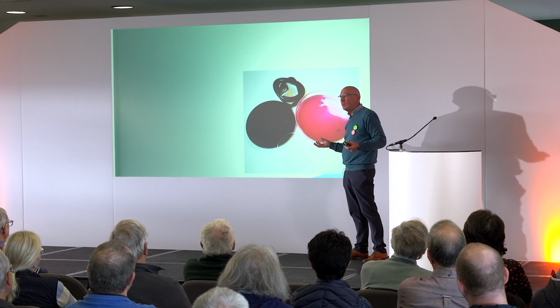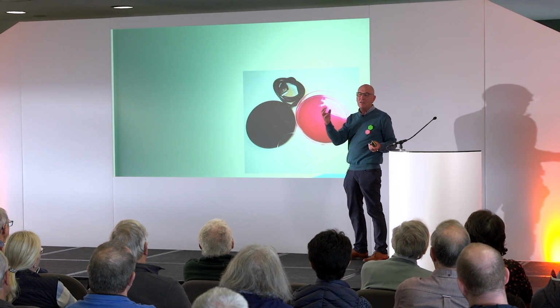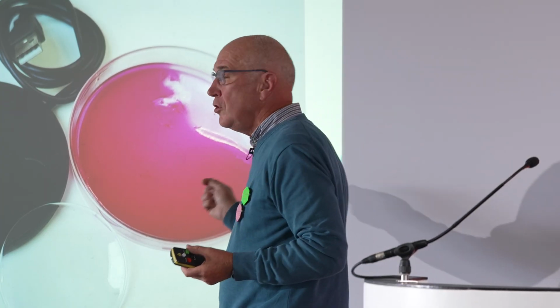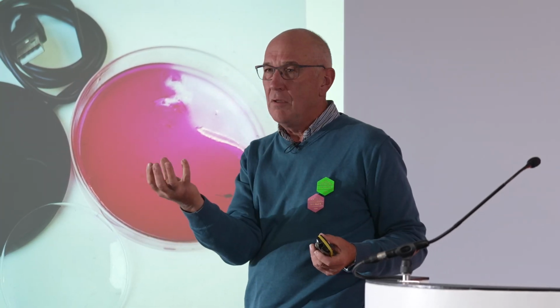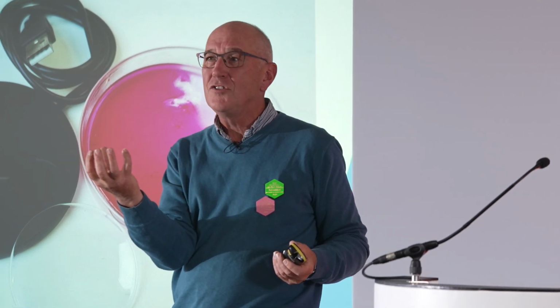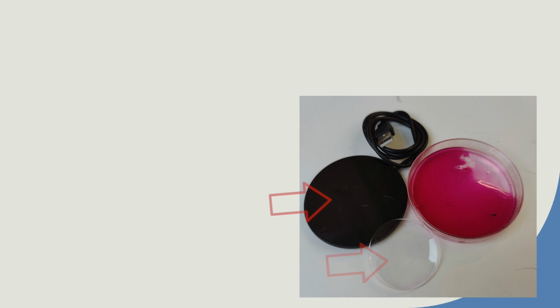So decant your stain into something small and usable, because you don't want to buy a little jar of stain and then find that you've contaminated it on the first day. Some watch glass, and this is a coffee warmer, a USB coffee warmer.